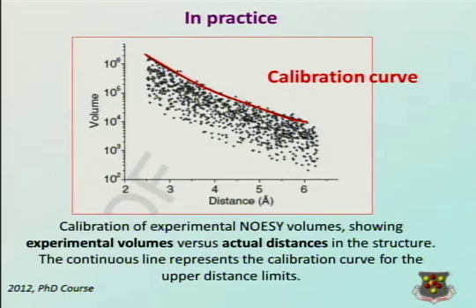Okay, so if you for example take this value here, the volumes that are larger than that intensity all belong to pairs that are at smaller distances than what you obtain from the red curve, which is 4 point something. So if you are at 3, you may get a volume of this intensity if your real distance is 3, but you will use 4 nevertheless.